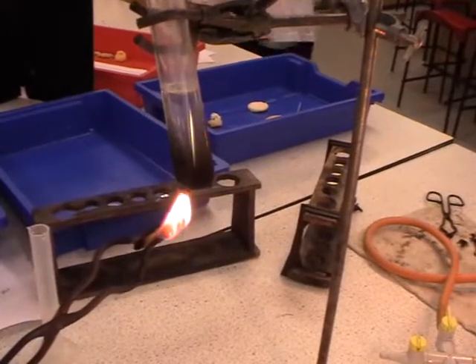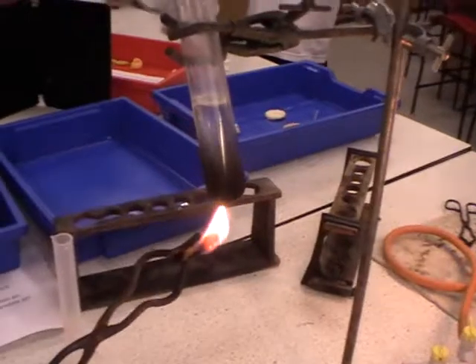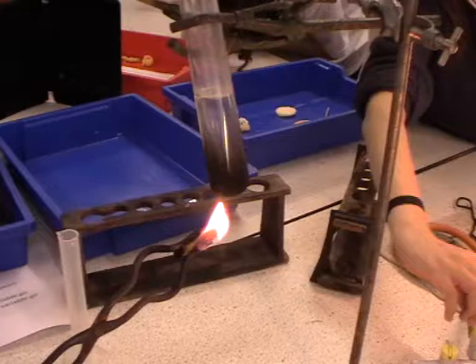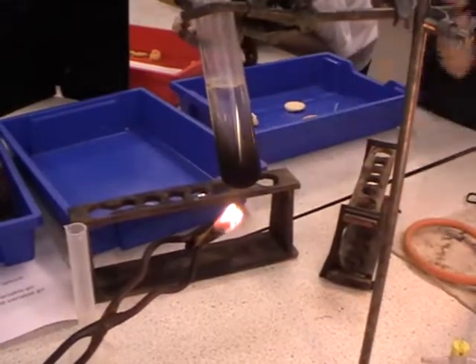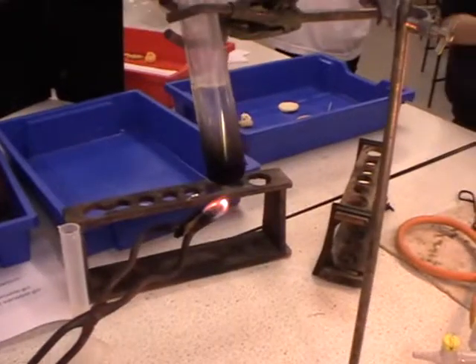If you turn off the gas tap when you finish with your last snack and have a little look at your results. The temperature was 23 to begin with and it went up to 43.